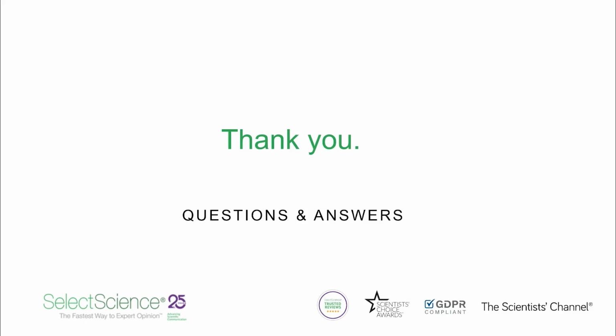Great, thank you, Joe. So yes, the next question we've had in is how to formulate the lysis buffer and determine detergent concentration for a homemade kit.